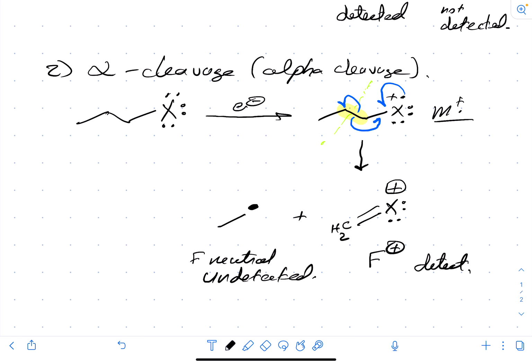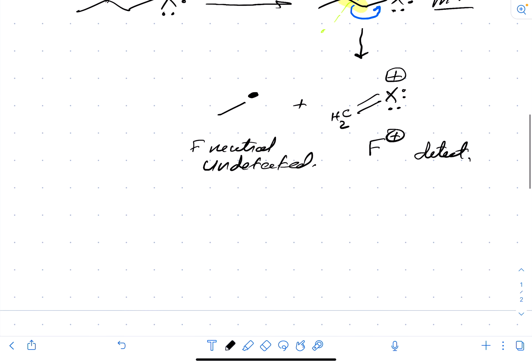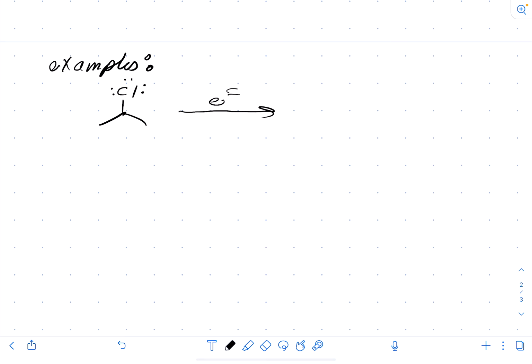All right, so let's look back at this 2-chloropropane that we were looking at just a minute ago. Okay, and we'll swing back and look at that. So let's look at just a few examples. This is one that we had an example of the mass spectrum of this compound. If I take that material and hit it with a high energy electron beam, I can eject a single lone pair electron from that chlorine. That's going to give me a radical cation.